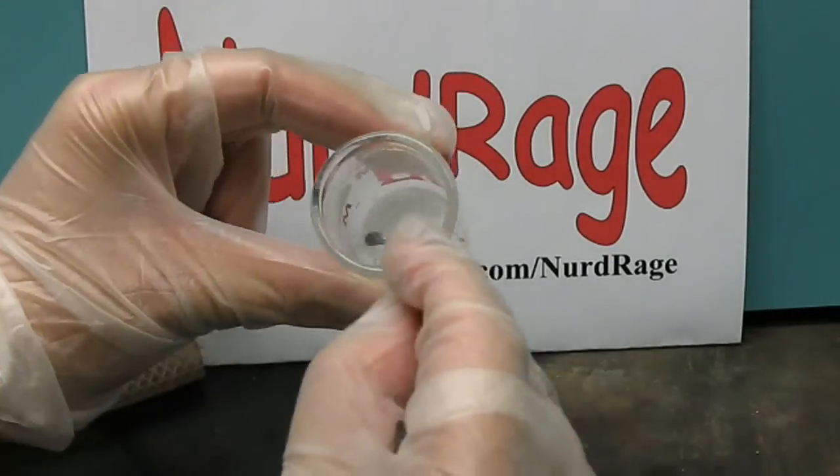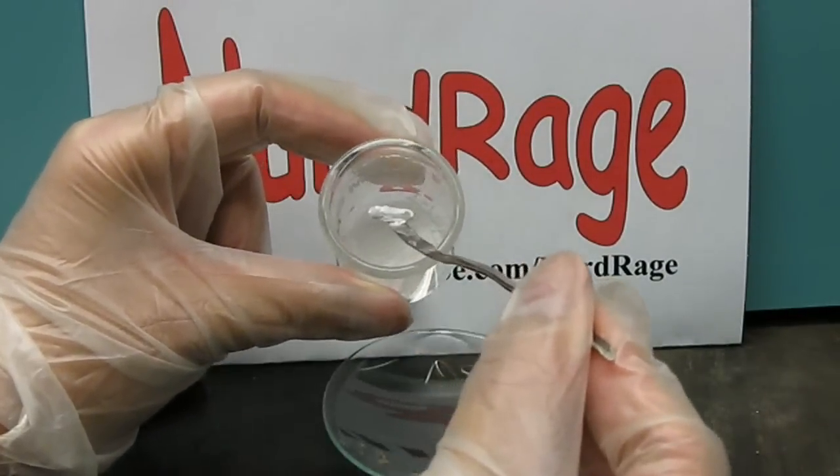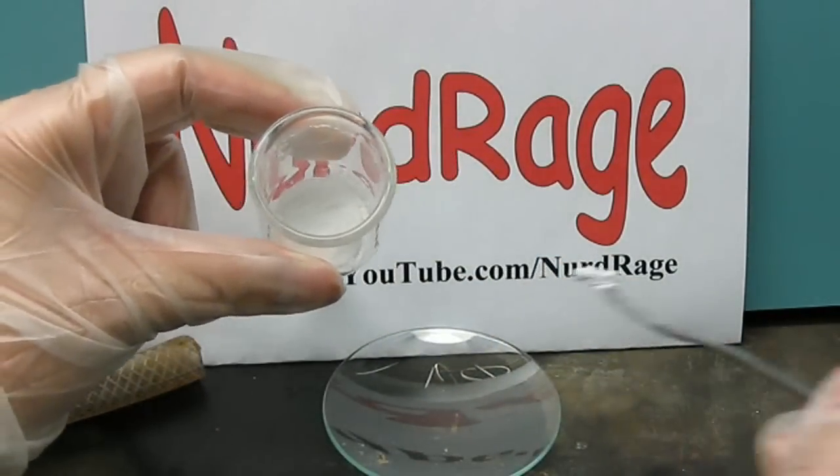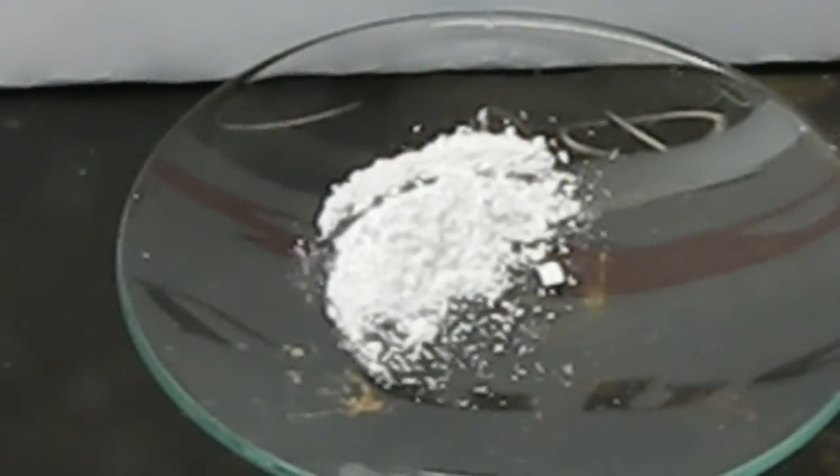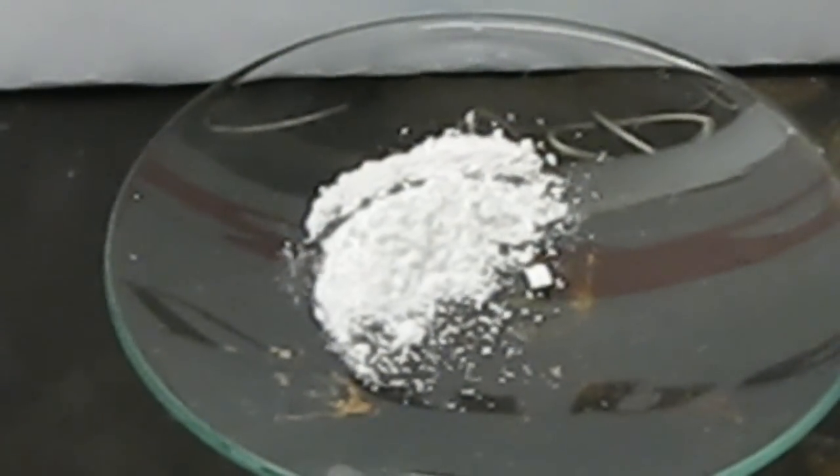Carefully scrape it out. Remember to retrieve the stir bar we put in earlier. There we have it — pure bis-2,4,6-trichlorophenyl oxalate, better known as TCPO.